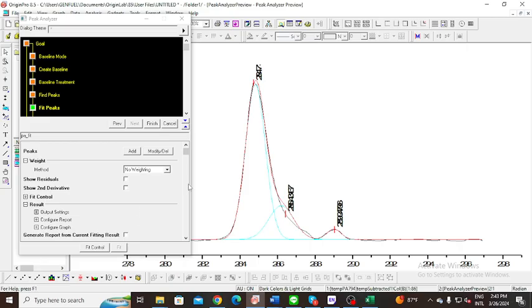The one that will remain will be the red one, or the black? All of them will be here, but the one that we want to emphasize is the blue one, to make the difference between them. And after this, click finish.